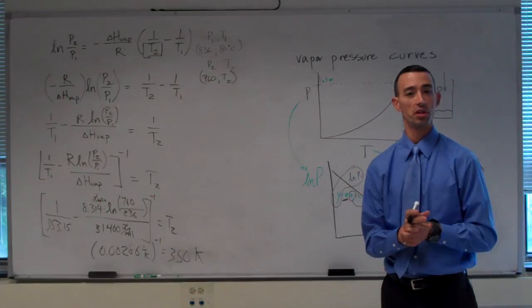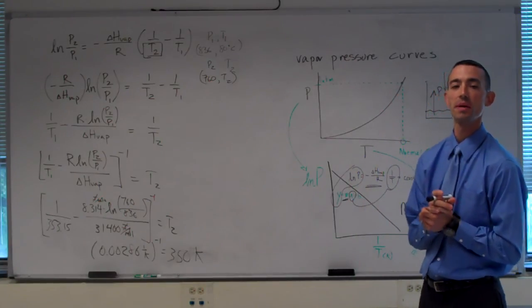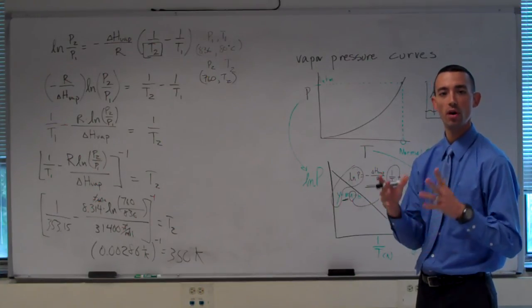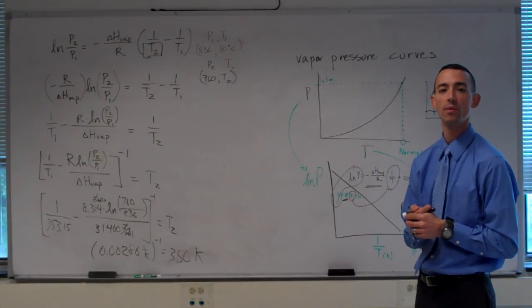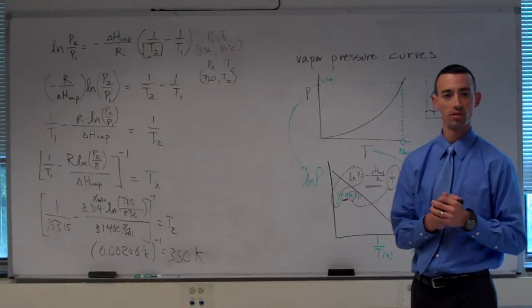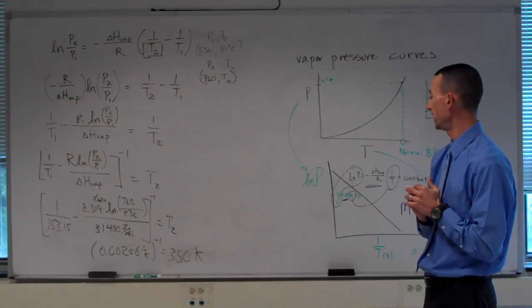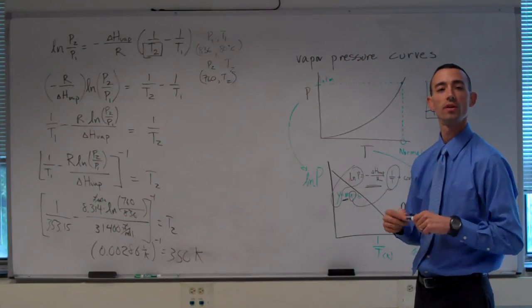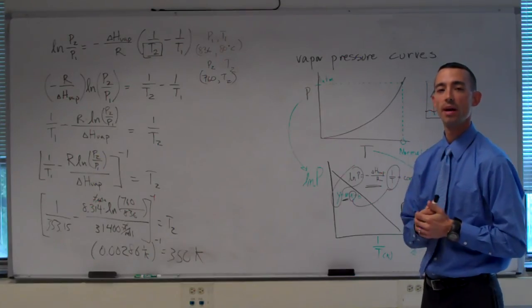Again, not too challenging in terms of the experimental work. You simply need a graduated cylinder, a large beaker, and a hot plate. Be careful of the temperature of the beaker. It won't look hot, but it will be plenty hot when you're working with it. We'll need a thermometer throughout the experiment to determine the temperature of the water. And from then on, it's a simple matter of the data analysis. And I'll show you that in a separate video. So good luck in the experiment, and I hope you have a nice time.